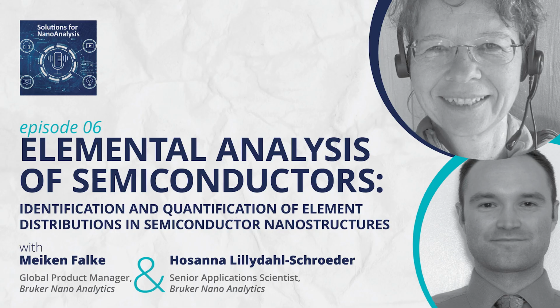Yeah, you are right. The two techniques are kind of overlapping already. If we come from TEM, we could first speak about doing TEM in SEM. Of course, one can put a TEM sample into an SEM. It's actually being made in an SEM, so in FIB, right? And it is amazing what is possible in SEM with electron transparent specimens. Depending on the quality of the beam and of the SEM, nanometer scale analysis is possible with a thin sample, and also TKD, structure orientation analysis, which is important for certain semiconductor parts, can be done in SEM.